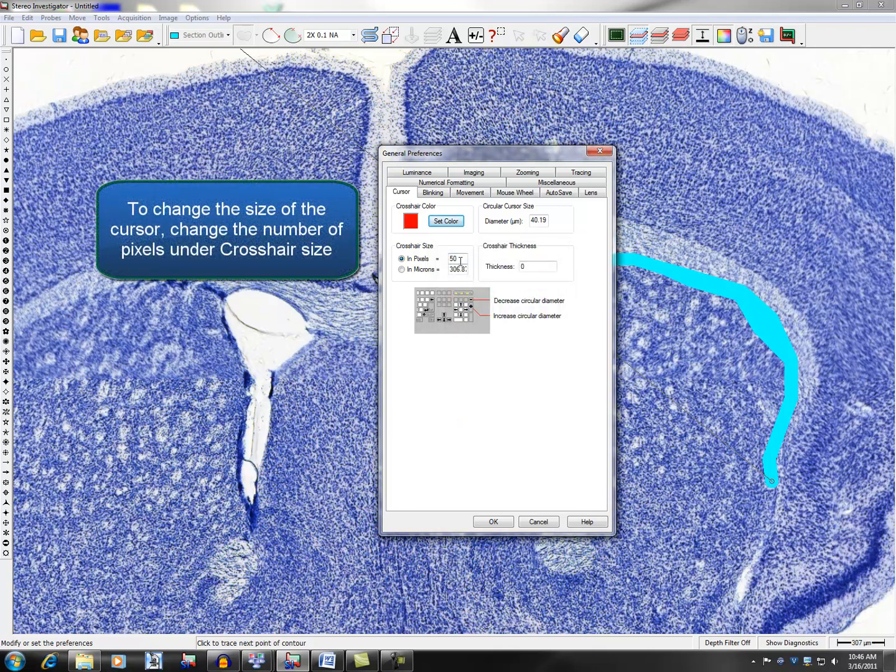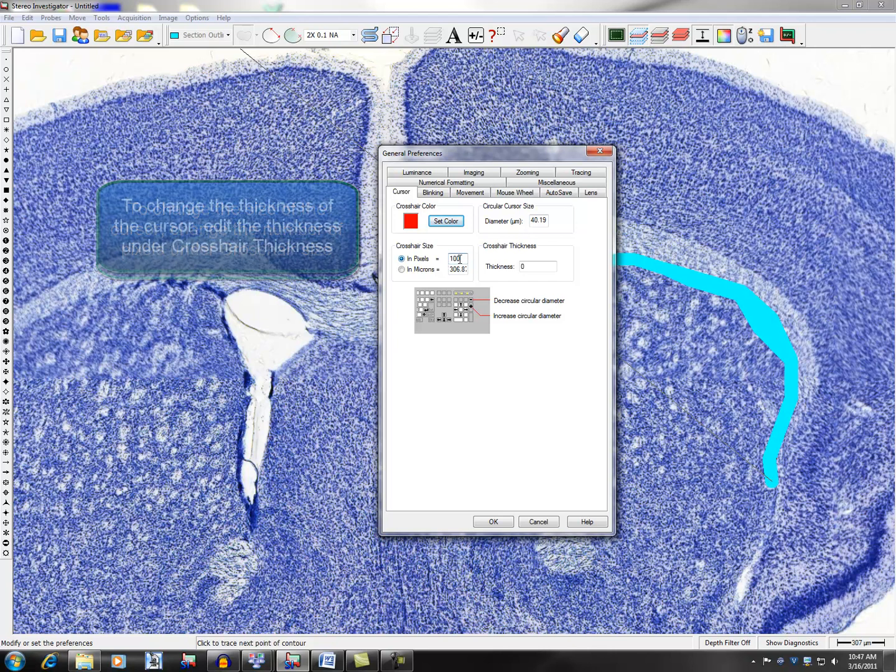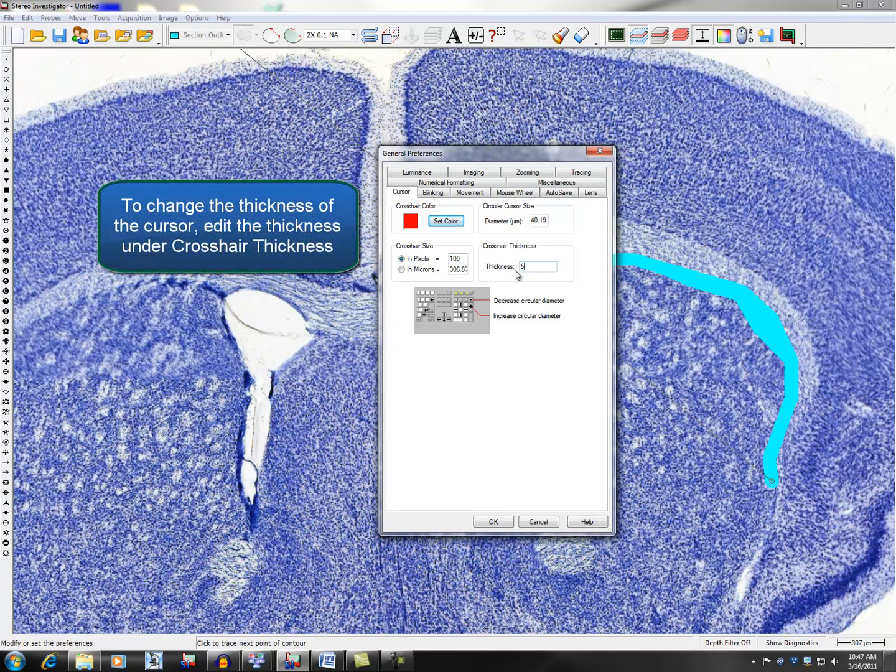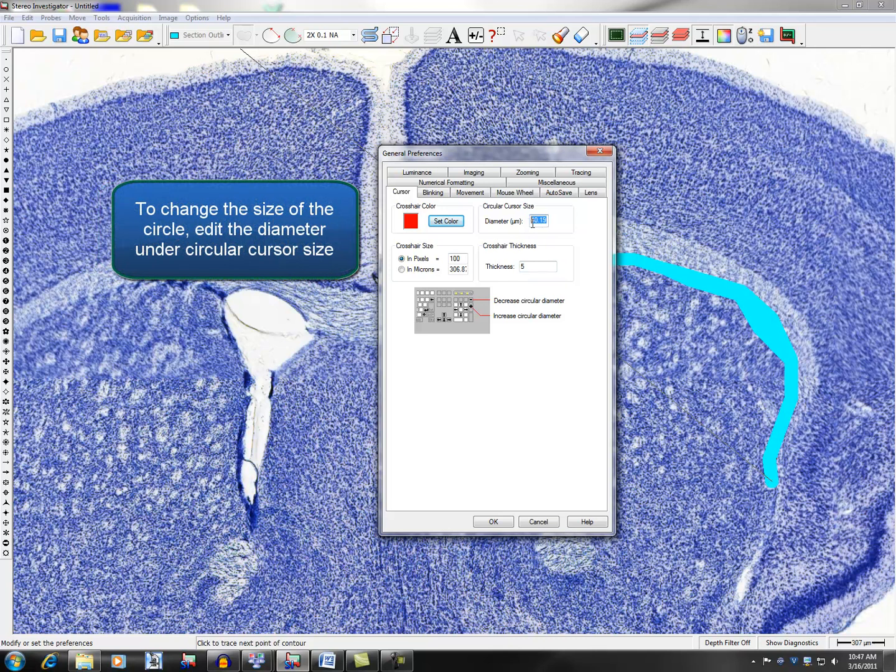To change the size of the cursor, change the number of pixels under Crosshair Size. To change the thickness, edit the thickness under Crosshair Thickness.